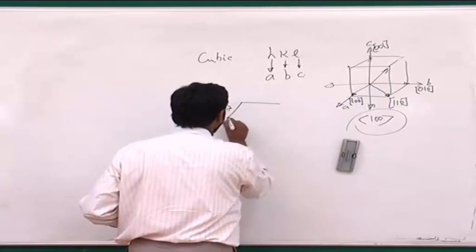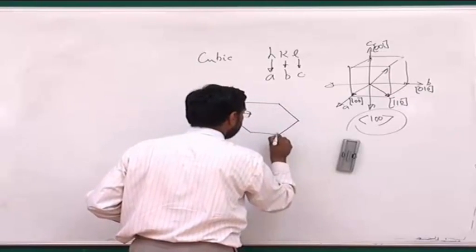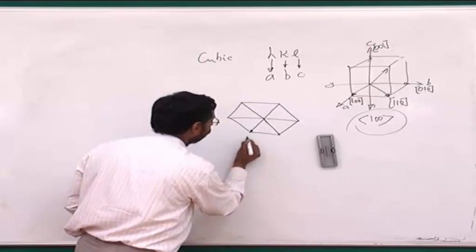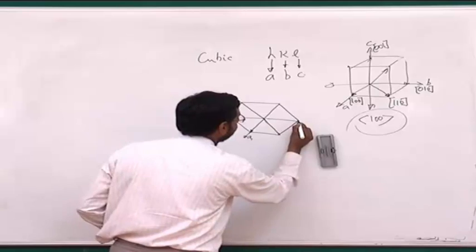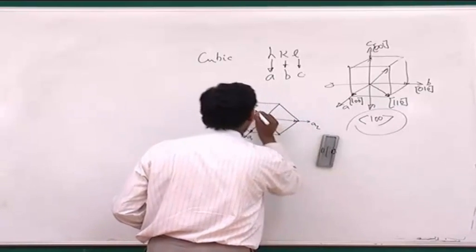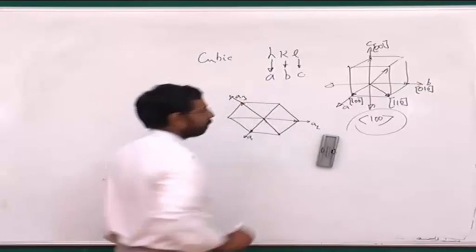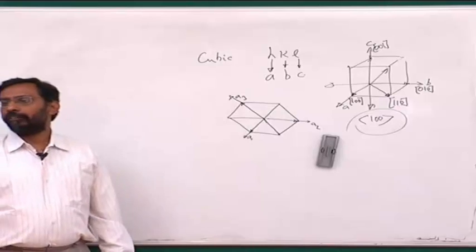And that is where a new indexing system came in. Here what people started doing is they started defining each of these vectors. For example, this is 1. They call this A1. Let us say this is A2 and this is A3. So now instead of 2, I have 3 in 1.